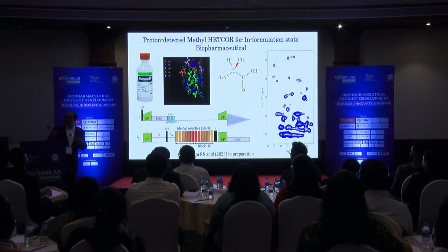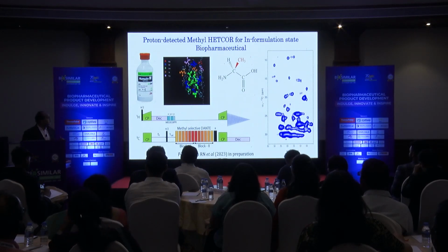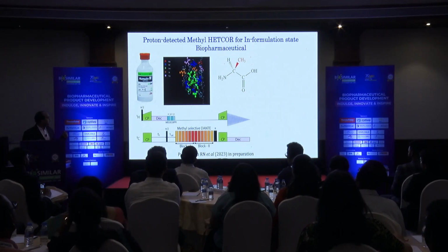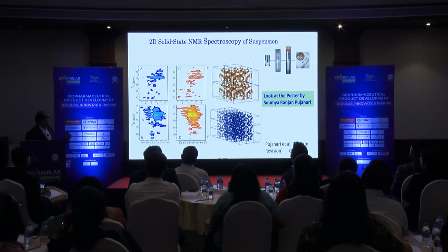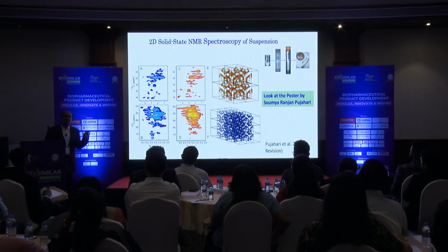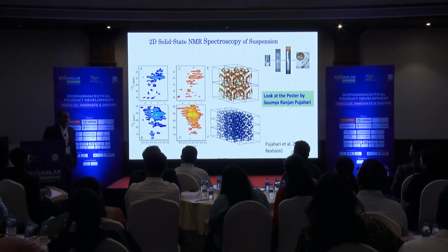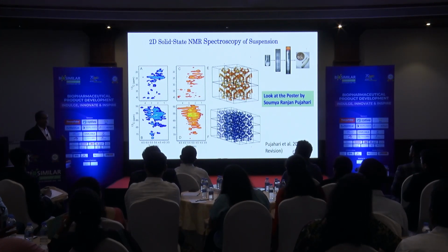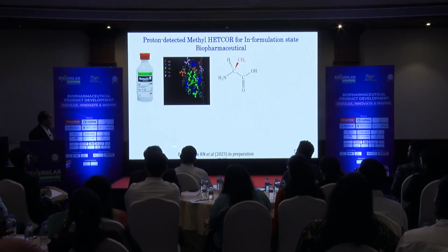So what we showed is that when we record this 2D for 2 different formulations, there was some change in the peak, right? Can you just go back 1 slide? More, here. There are some differences. So we combine this with wax and look at their packing, which was slightly different. Therefore, this solid state NMR spectrum was slightly different. So we developed another technique with proton detection, and we got a very nice resolution in the 2D spectrum.